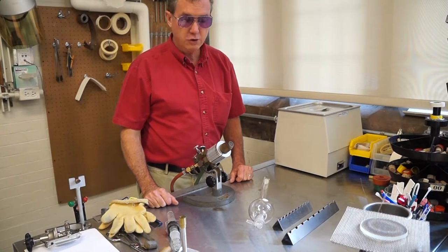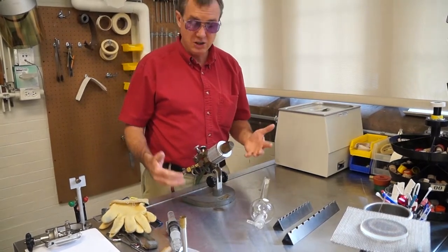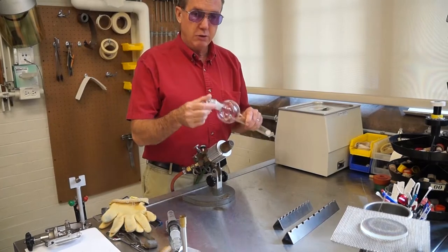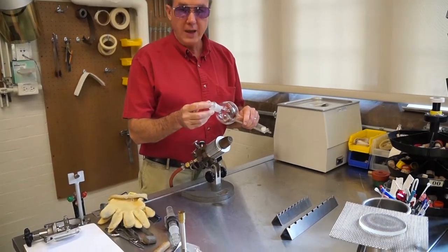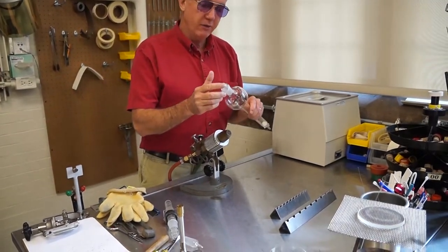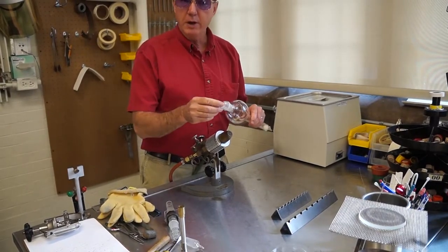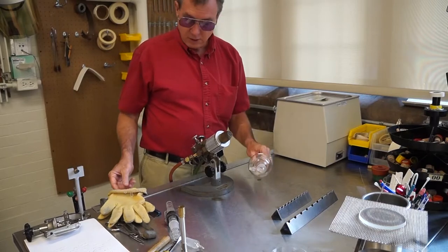In this video, I want to go over how to get ground glass joints unstuck. This happens when your inner and outer joints are put together without any grease, any Teflon tape, or Glendman rings. I cover that in one of my other videos on how to use that stuff.